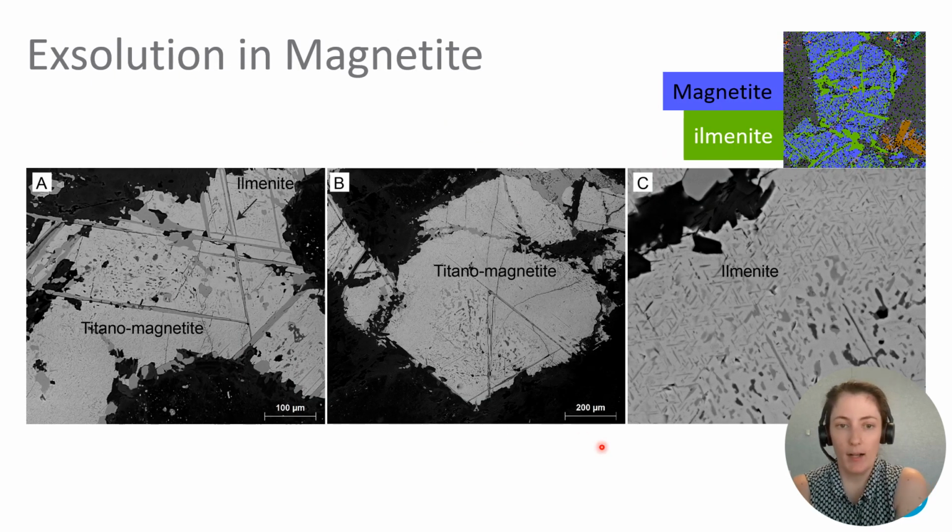So when you are quantifying minerals using the TIMA, you have to be a bit wary of exclusions or inclusions or things that are smaller than your step size. So in a lot of the cases, our magnetite analyses have exsolutions of ilmenite throughout them. This is too small for the TIMA to pick up when we are just stepping at 12 micron step size.